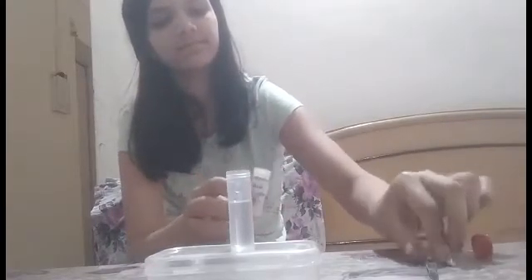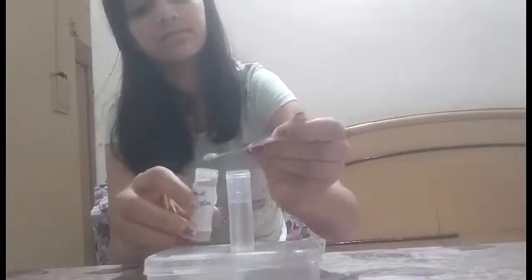Now we have to add yeast powder with the spatula in it. After that, when we smell it, it doesn't smell at all.